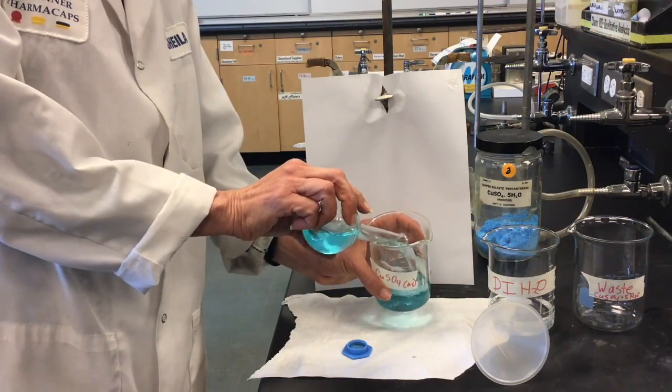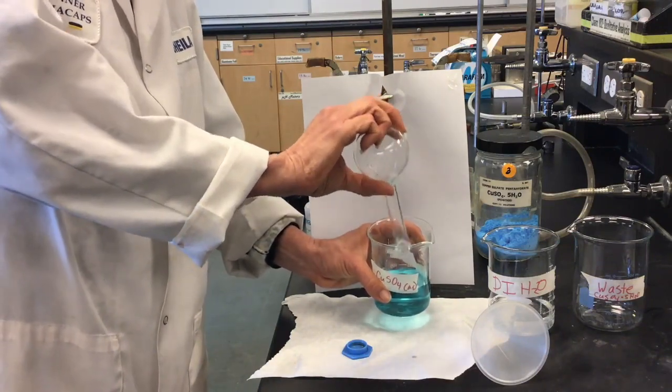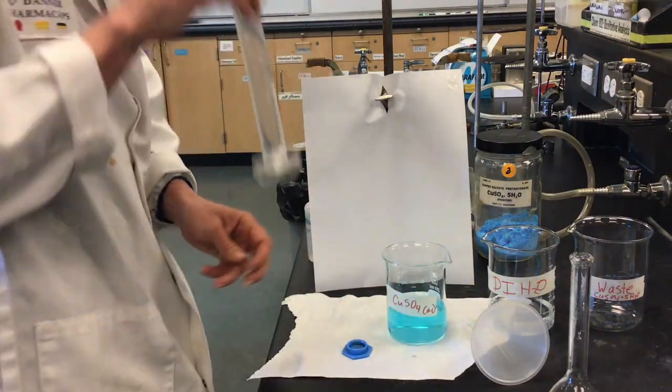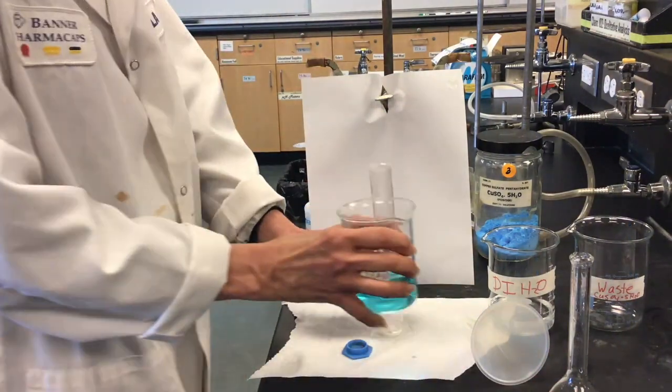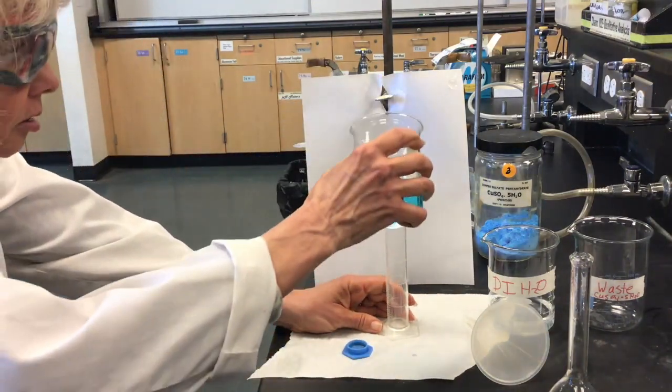And then we're going to measure an exact quantity of the copper sulfate pentahydrate. We want to measure 25 ml, so we'll pour that back into a graduated cylinder. Again, you want to measure this at eye level.